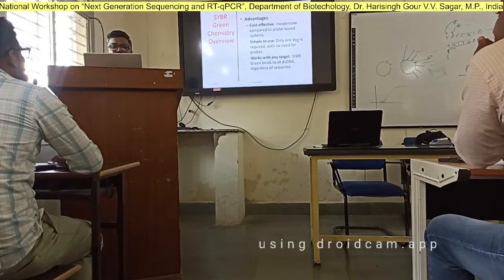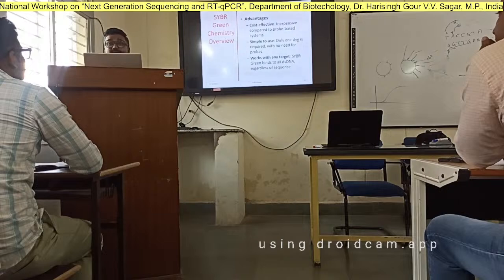When it's only one type of dye, you don't need to use multiple tools. So the instrument that you use can be very cheap. Now if you have a PCR machine that works for multiple probes, they need lasers. For each fluorescent dye, you need a different excitation, and each excitation means a new laser block.